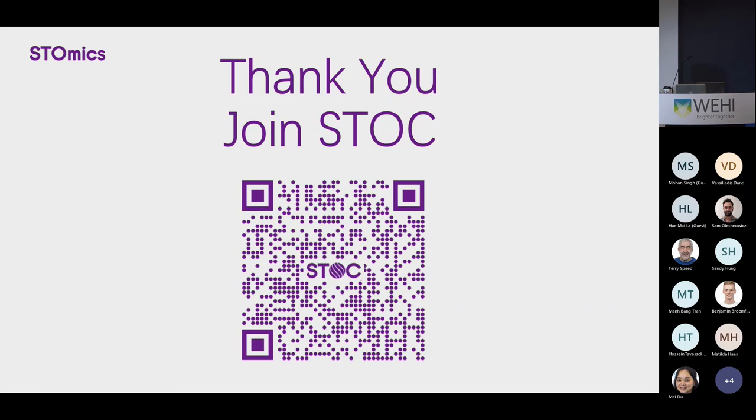Okay, the other question is a slightly tricky one. We're still tied to doing sequencing, and sequencing is expensive, right? And in fact, the cost of sequencing has got nothing to do with our capability to do this stuff. So how are you going to make sequencing cheap enough that this will be possible for everybody?